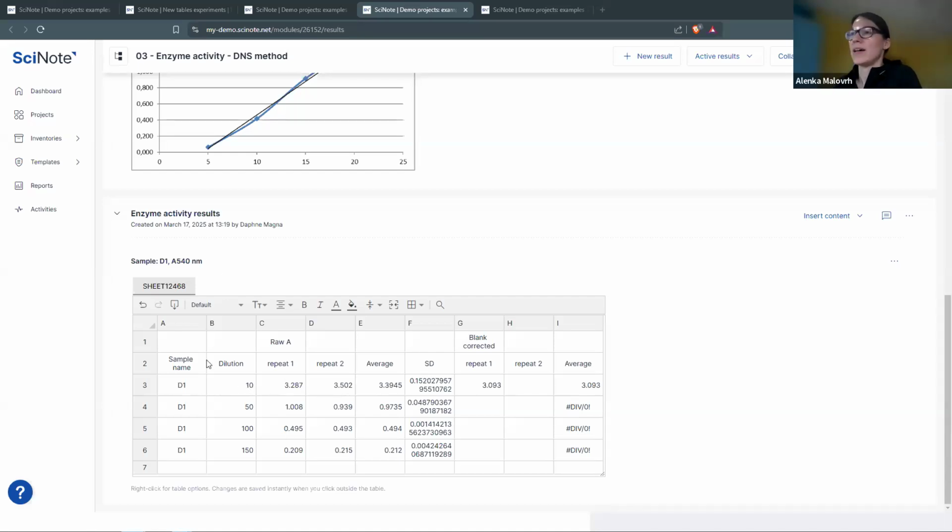I have them here, and let's say I want to make this table also look a bit nicer. I can, again, merge the cell, and this is my raw data. I'll bold and change the background so it's visible and more clear. And I will mark this row again in a different color, just so that it showcases nicer where the data is and what is the remaining part. I'll also add, in this case, a border, so the data is nicely divided from the information that I have about it. And also let's put it here.